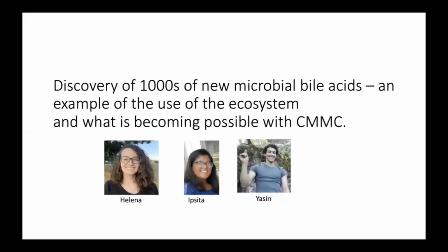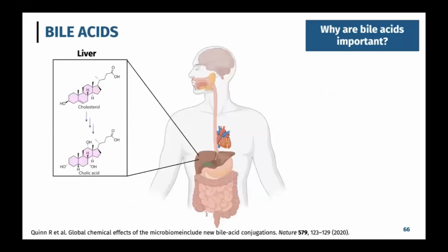So what I want to do next is show you how we can use some of these tools within the CMMC to discover and really enrich what we know about new metabolites. The focus here is just on microbial bile acids, in part because we discovered some really interesting microbial metabolites a few years back. Now, some of you may not look at bile acid biology routinely, so I'm going to give you a little bit of background behind it.